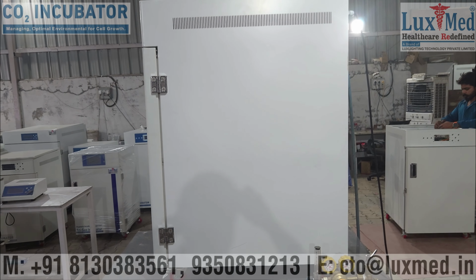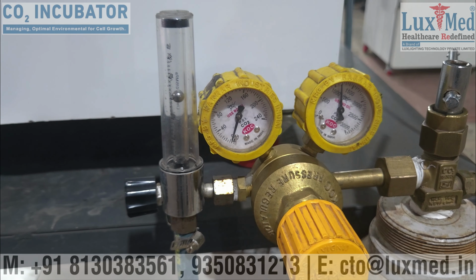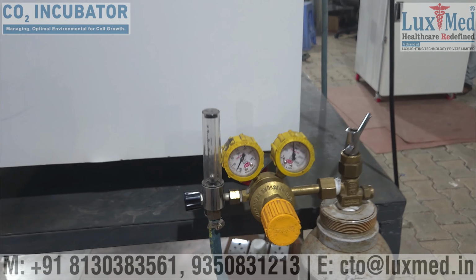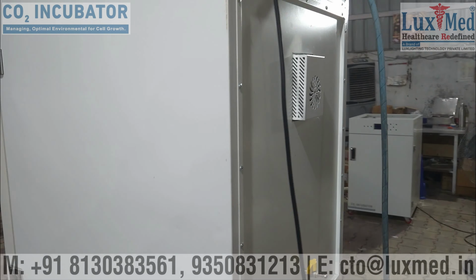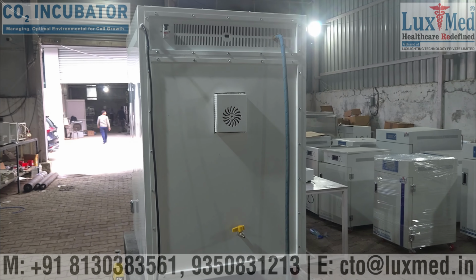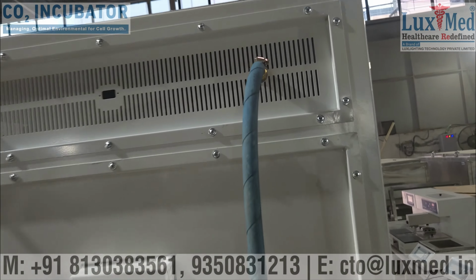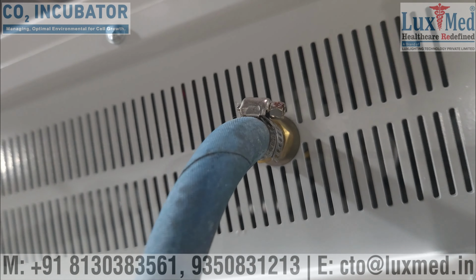Uses of CO2 incubators. Cell culture. CO2 incubators provide a stable and sterile environment for growing cells, ensuring optimal conditions for cell growth and differentiation. In vitro fertilization, IVF. They're used to cultivate and maintain embryos during IVF, providing the right environment for embryo development.